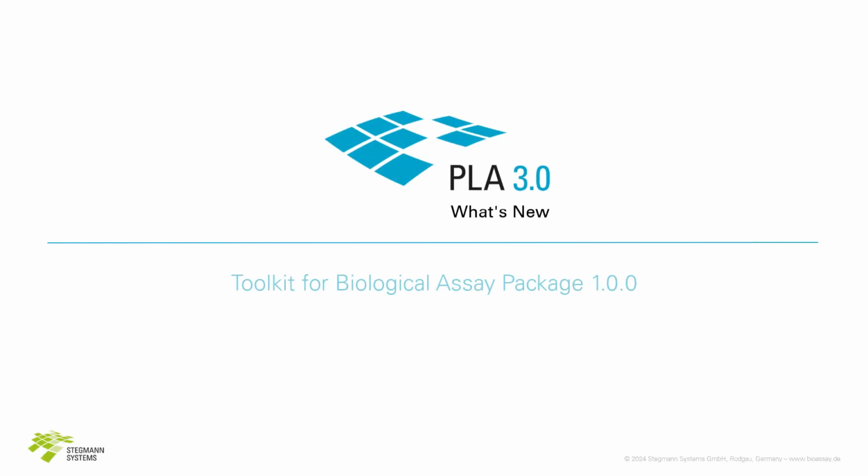Welcome to another video in the PLA 3.0 What's New series. In this video, we introduce our new toolkit for Biological Assay Package, version 1.0.0.